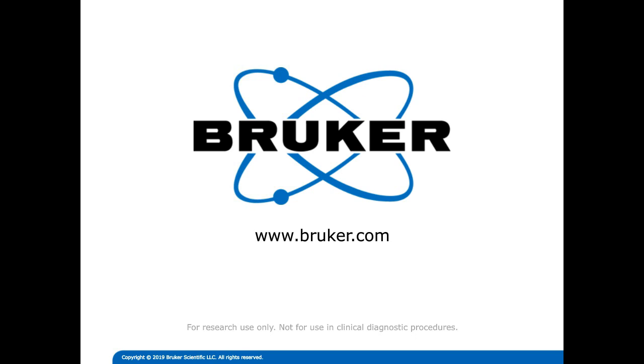Typically, the electrospray QTOF sources that we have are very gentle, and so we don't really see a lot of depurination and other modifications in source. With the MALDI, again, that's another question because sometimes it is possible to see such happening on the source itself.